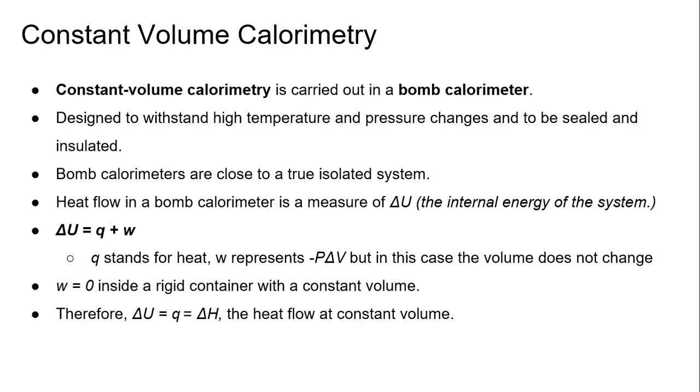This is a constant volume calorimetry and is usually termed a bomb calorimeter. It is just an insulated container, a very well insulated container. It's designed to withstand high temperature and pressure changes and to be sealed and insulated. Bomb calorimeters are very close to a true isolated system. Heat flow in a bomb calorimeter is a measure of delta U.